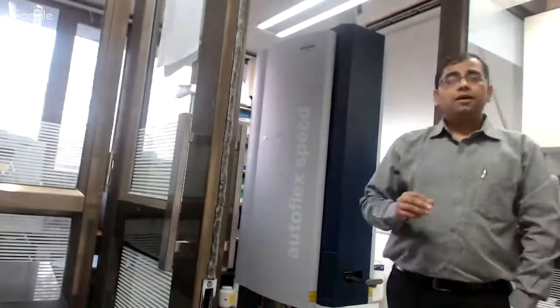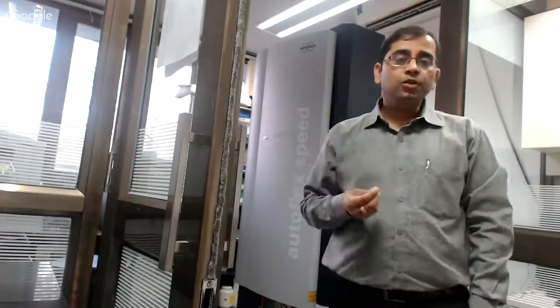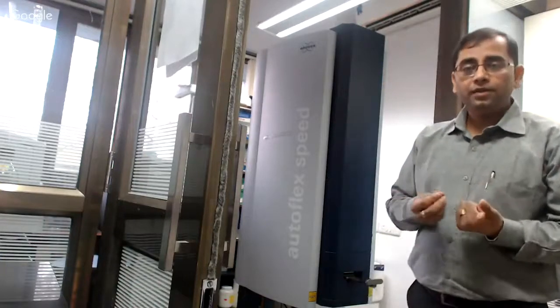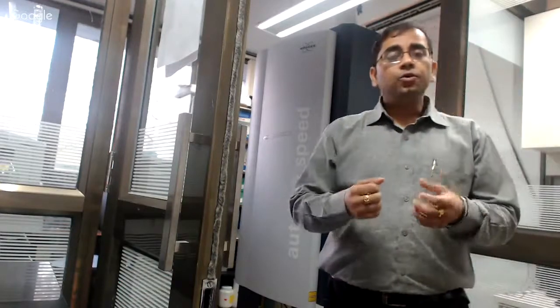The entire process starts with sample preparation. You take your protein of interest, add the matrix, mix them well, and then place them on the MALDI plate, which is sometimes a 384-well plate or a 96-well plate. On this plate you have your protein of interest, which you want to analyze. You insert it inside this instrument, and then you do laser bombardment on it.